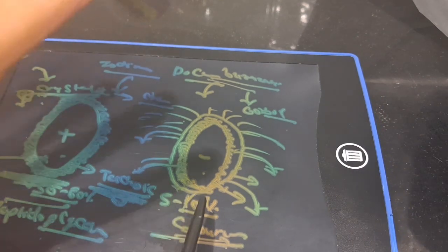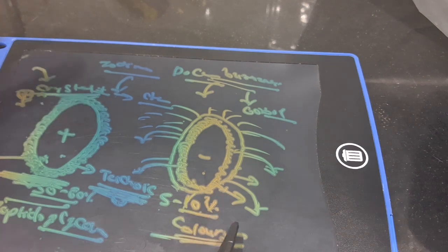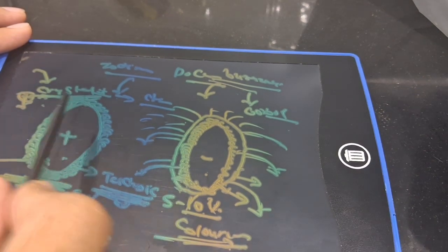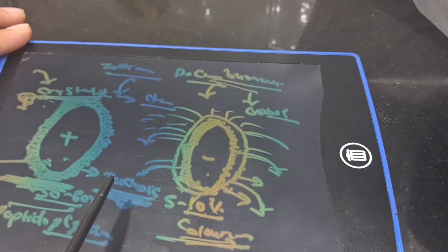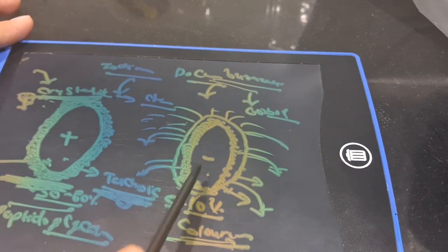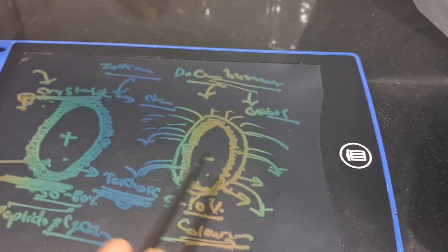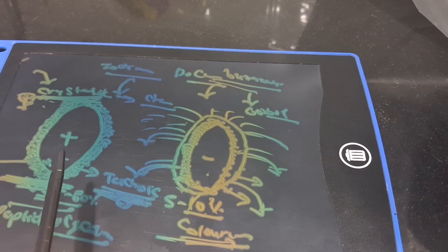But in gram negative, after the decolorization, you see that all the negatively charged polymers are free from the positively charged crystal violet. They are free because the crystal violet and Gram's iodine complexes have leaked out. So they are empty. They are sitting idle and waiting for somebody to bond with them.